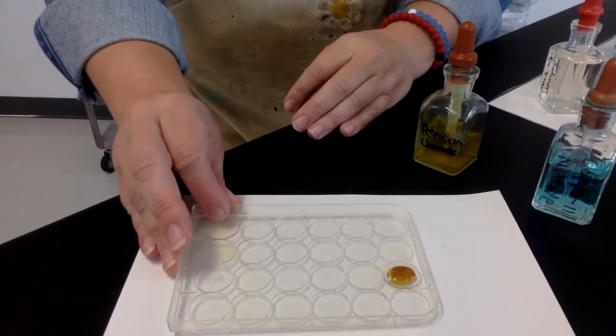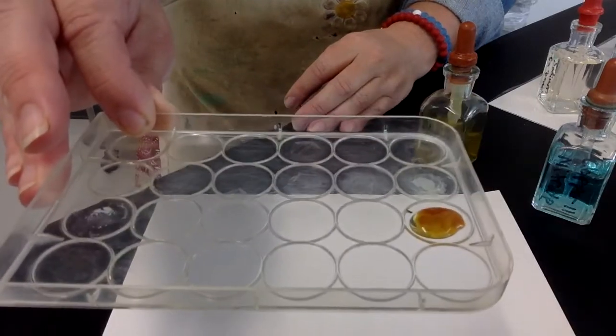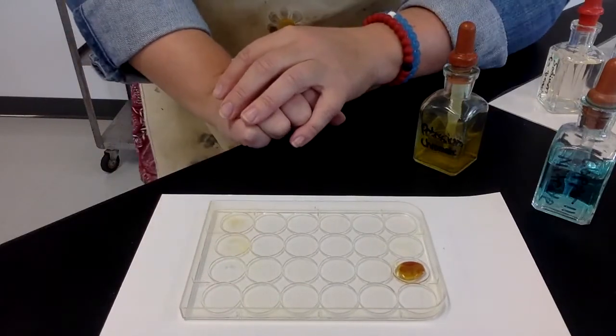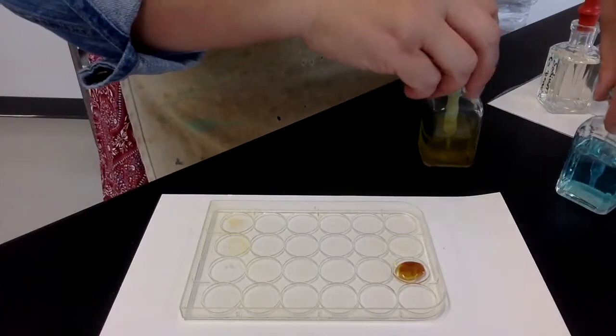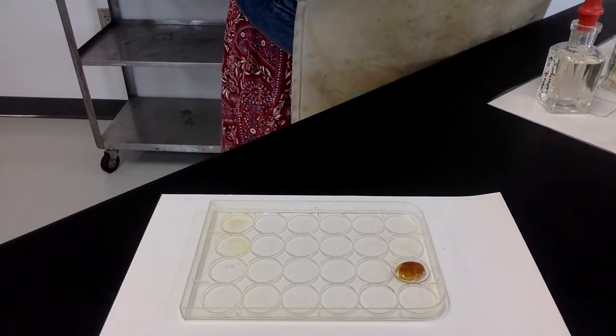And then as you look at it a little bit closer, maybe you notice that it's getting kind of yellowy red even a little bit. So that's something that's kind of interesting. Sometimes the reactions take a little bit longer because all the particles need more time to mix together. So that's kind of an interesting one. All right, that was reaction number 1. Let's do reaction number 2.